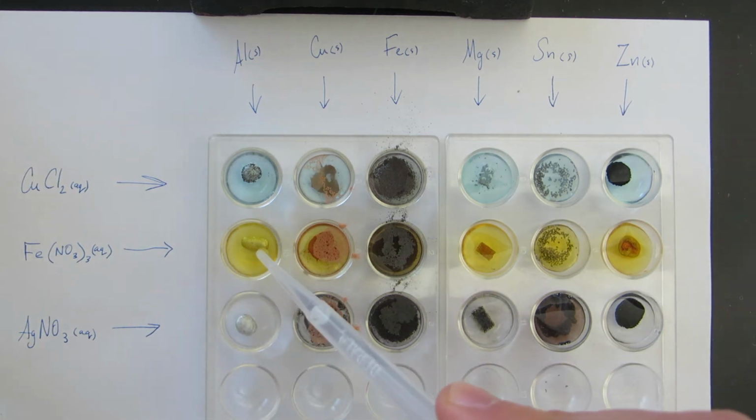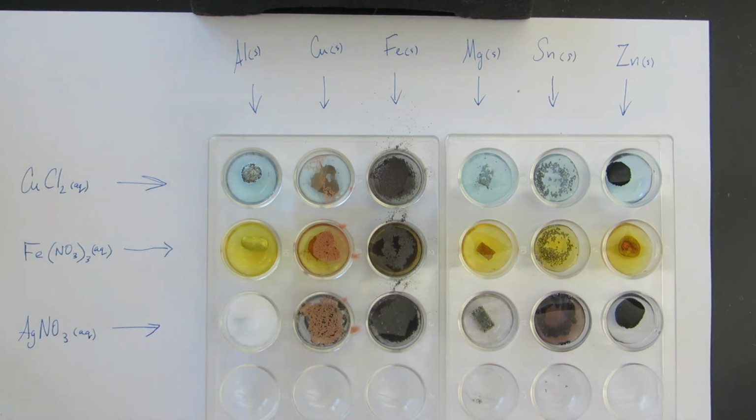Just want to make sure that, oh crud. Dang it. Alright, so I added chloride, and silver chloride is not soluble. So I'm going to redo that one. Forgot about that. Alright, so I added chloride. Iron chloride is soluble, but silver chloride is not. So we actually put a double displacement reaction right in the middle of trying to look at some single displacement reaction. So I'm redoing the silver and aluminum.